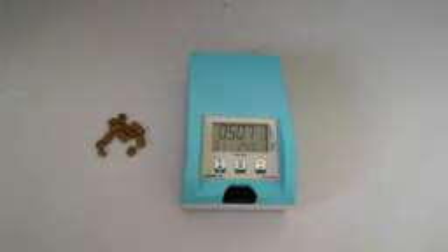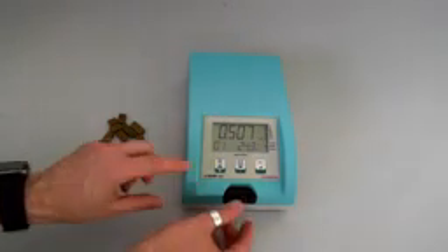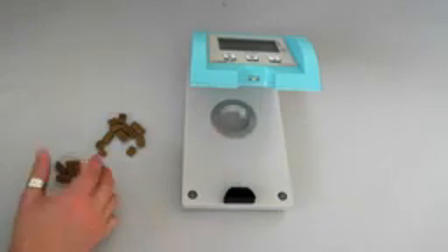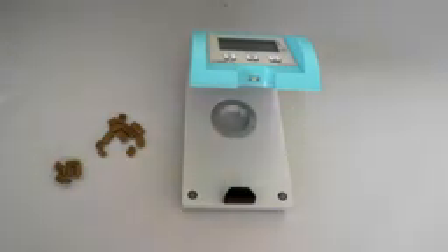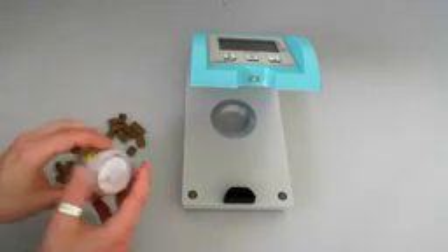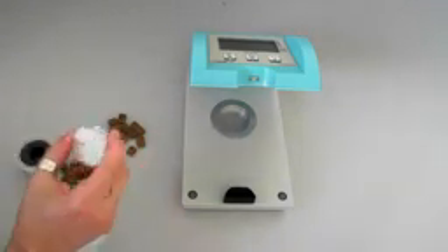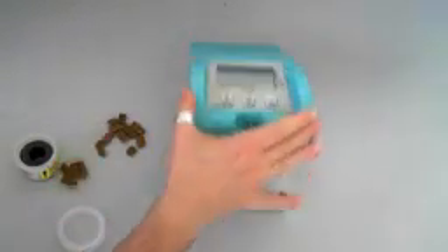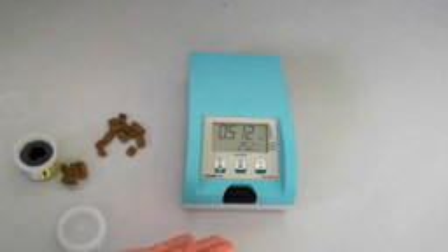0.7 is the value for this kind of sample. So that's it. I can just take the next one in the same way I measured this one, or I can check with one of our salt standards. Our salt standards are reusable — I can just place the next one in the sample chamber and do a verification the same way I did the measurement.